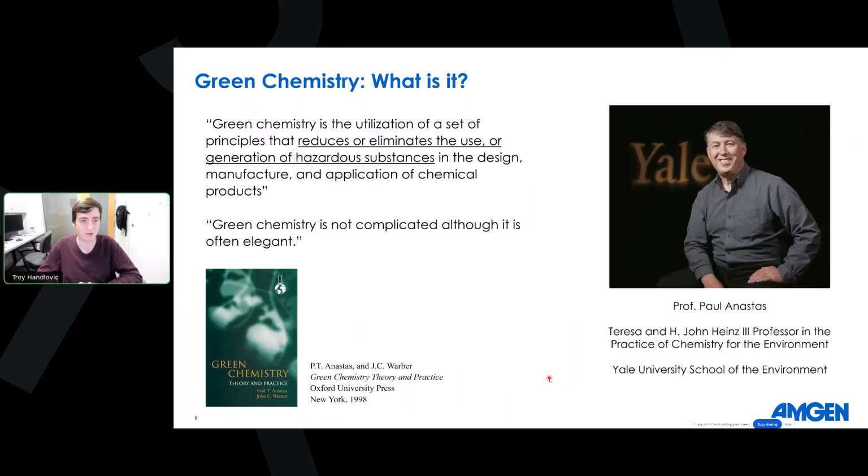And I always like to include this quote of his from a few pages later in the book, where he says, green chemistry is not complicated, although it's often elegant. So very small changes in your analytical methods can make large changes to their sustainability and impactful sustainability-driven decisions, which is really useful from these small little changes.